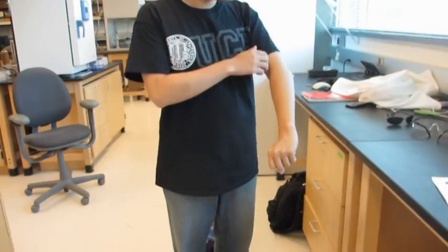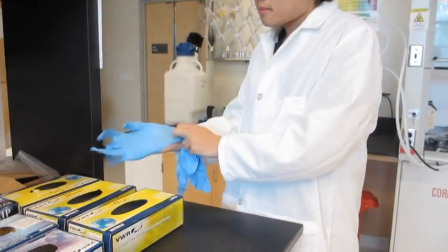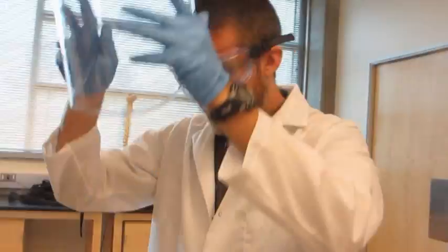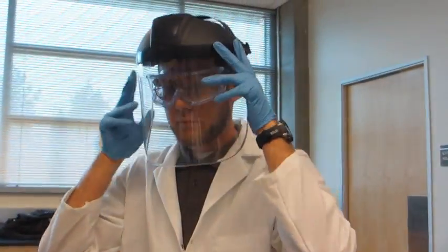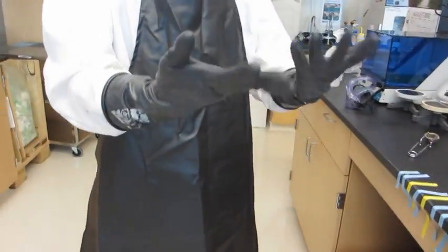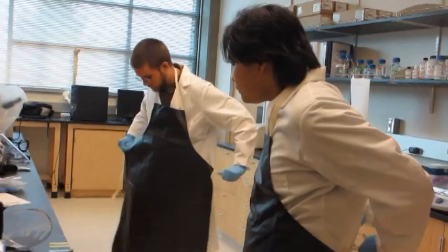When you're ready, put on the proper personal protective equipment. This includes long pants and closed-toed shoes, long sleeves or a laboratory coat, nitrile gloves, safety glasses with side shields or safety goggles, and a face shield, especially if there's a potential for splashes. In addition, wear PVC or butyl gloves over your nitrile gloves and an apron that is waterproof or a Tyvek suit. The idea is to put as much between you and the chemical as possible.